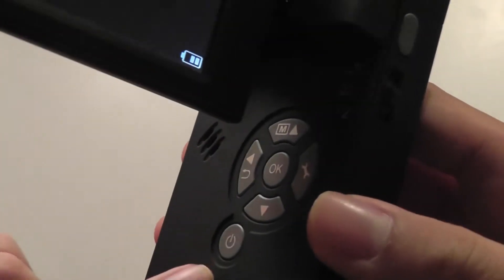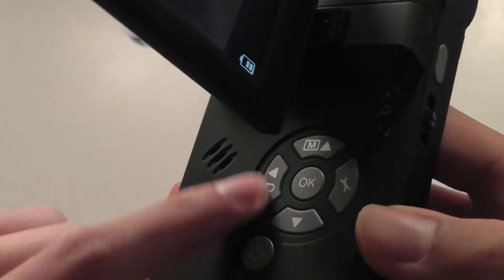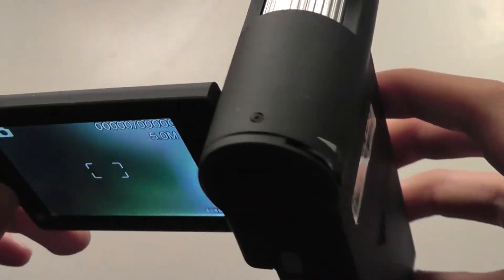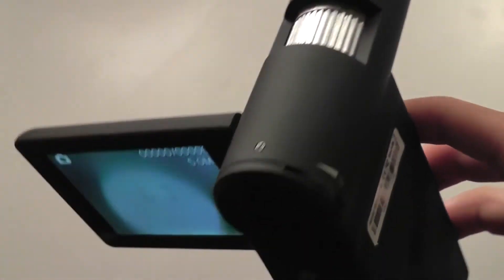On the side here, there's a built-in speaker for playing back audio. We have access to the up-down navigational controls, and also a built-in microphone on the very top as well.